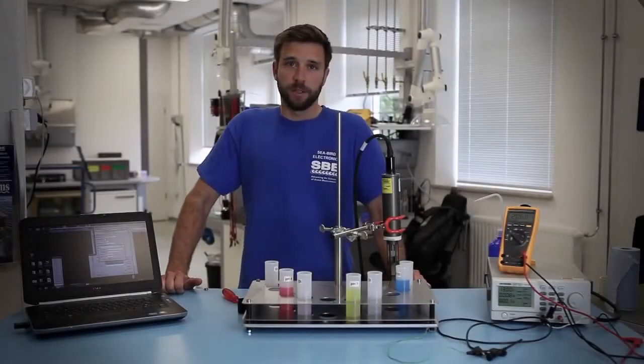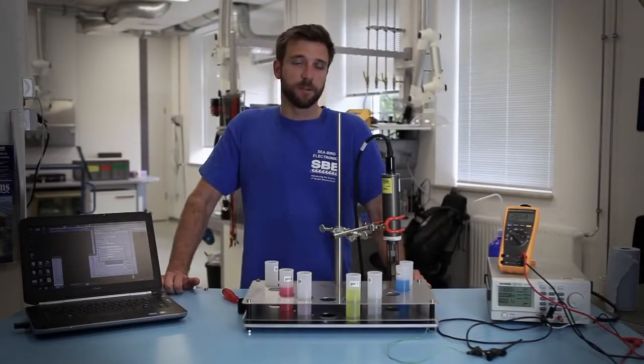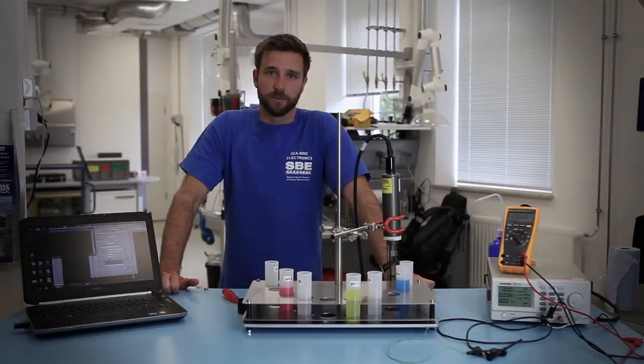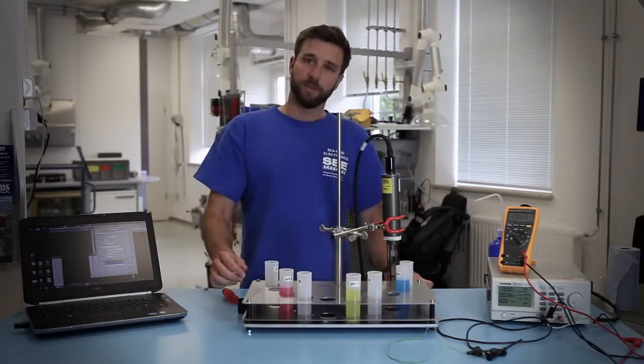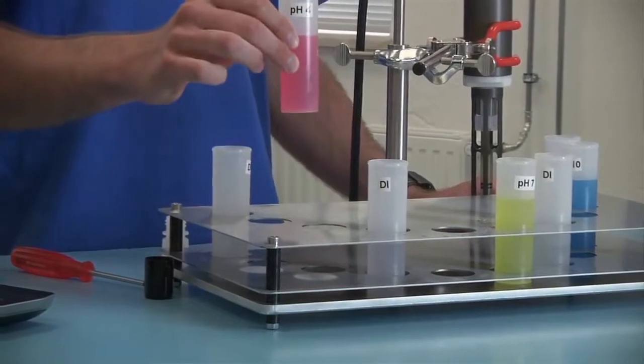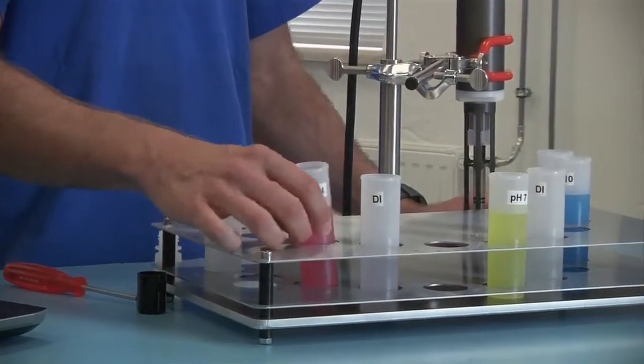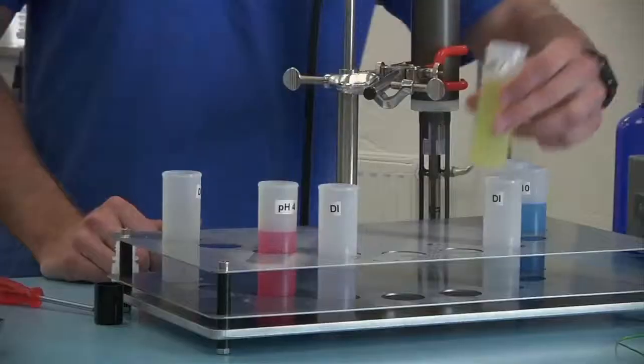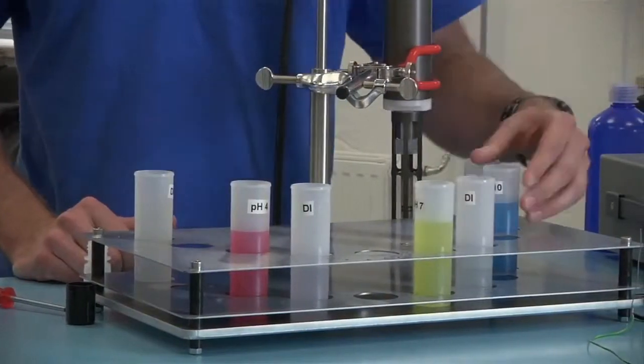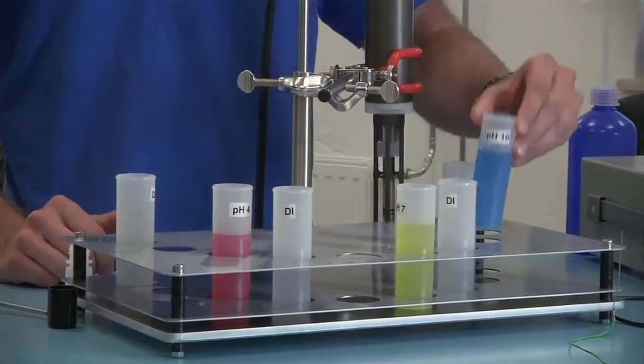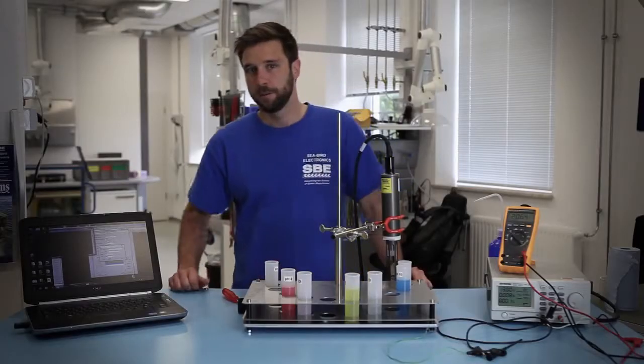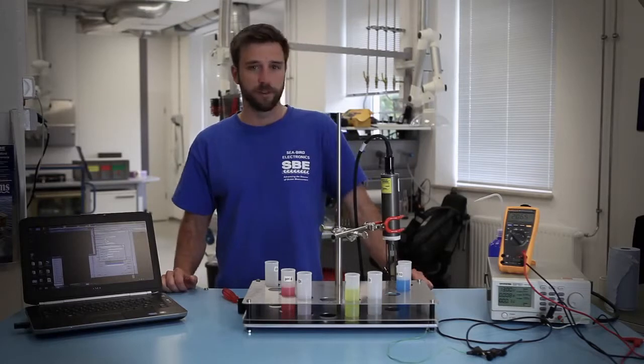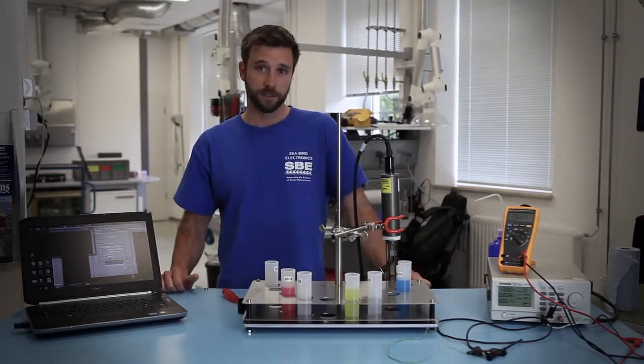Now we're going to be looking at the calibration of the SPE 18 or 27 pH sensor. To calibrate this sensor you'll need a few supplies. You'll need some pH buffer solutions. Here we're using a pH of 4, a pH of 7, and finally a pH buffer of 10. You can use whatever pH you select. You just want to have a little bit of variety in there to get a full range of the sensor.